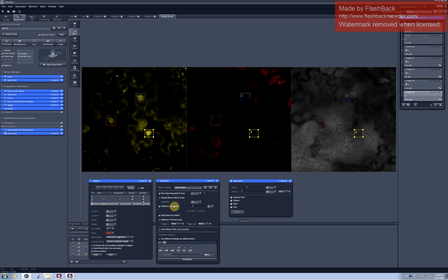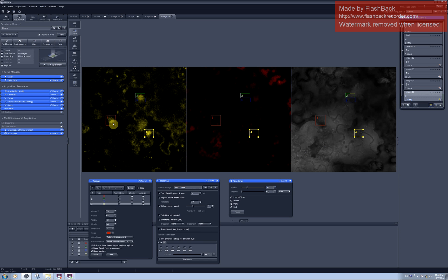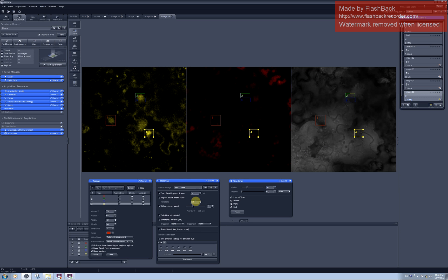Then the software will ask you about how many iterations would you like to run. It basically asks you how many times does the laser have to go through the area you selected to cause the photobleaching. And the number of iterations you can estimate only empirically. It will depend on the amount of the fluorophore present in your sample and how stable it is. I will ask for 100 times.